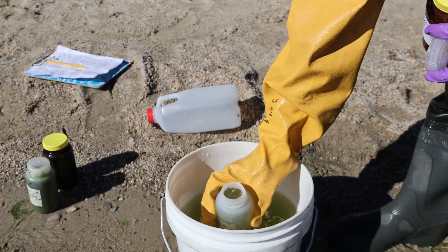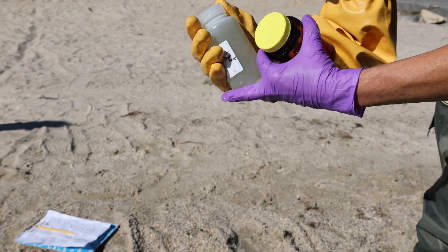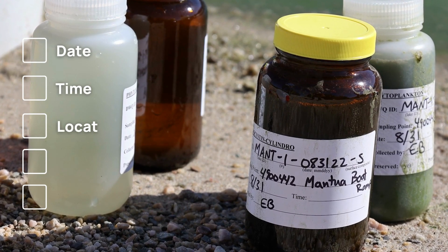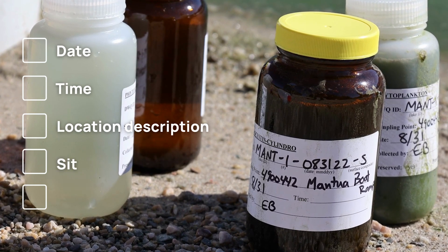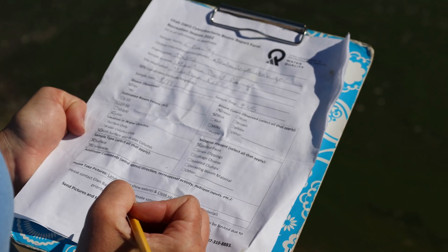Composite samples can also be taken from the side of a boat or off a dock. Label each bottle with the date, time, location description, site coding, and your initials. Be clear which sample type — composite or surface.